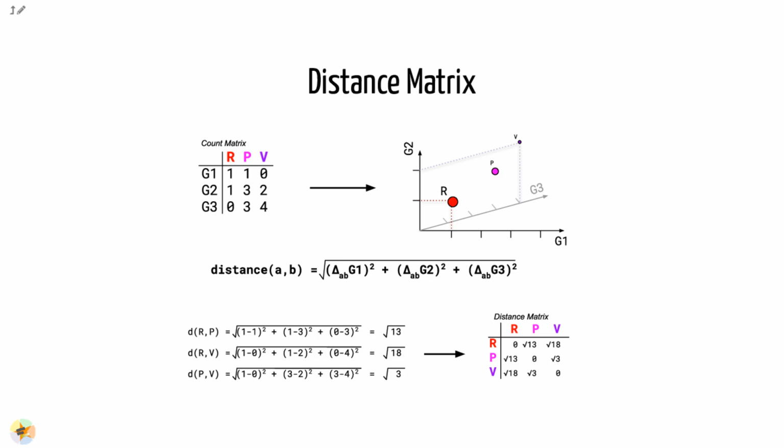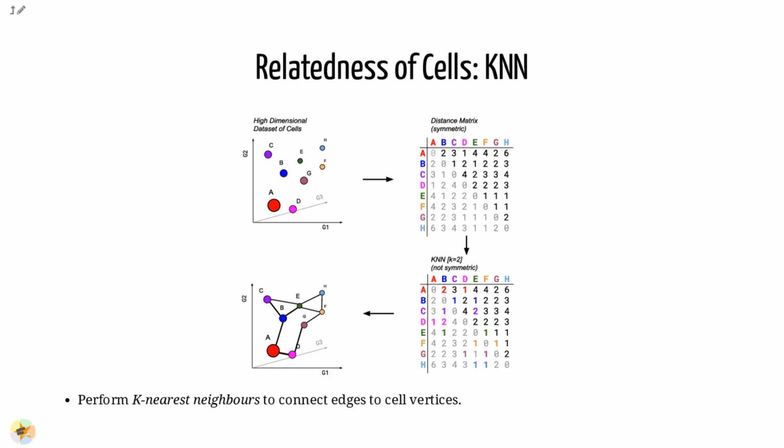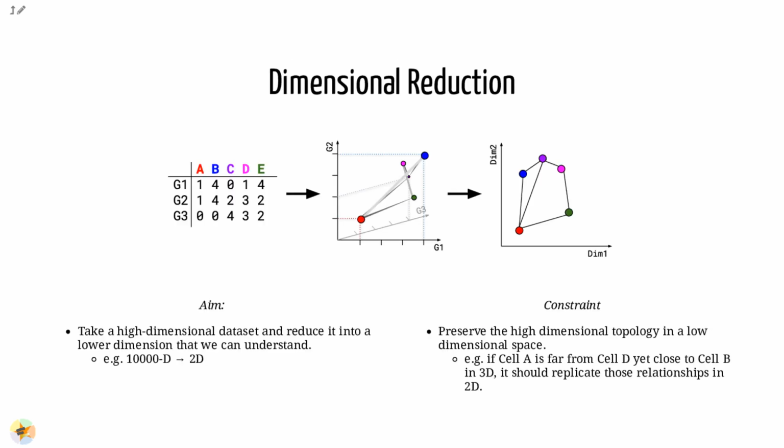Once a distance matrix is generated, we can perform k-nearest neighbors upon the distance matrix where directed edges are generated between cells. For each row of the distance matrix, k of the cells with the smallest distance values are selected, representing the nearest neighbor that current row's cell has to the selected column cells. If the edges are mutually shared between neighboring cells, then this is called a shared nearest neighbor approach. We can represent this three-dimensional space easily as three independent axes with points that denote the cells.